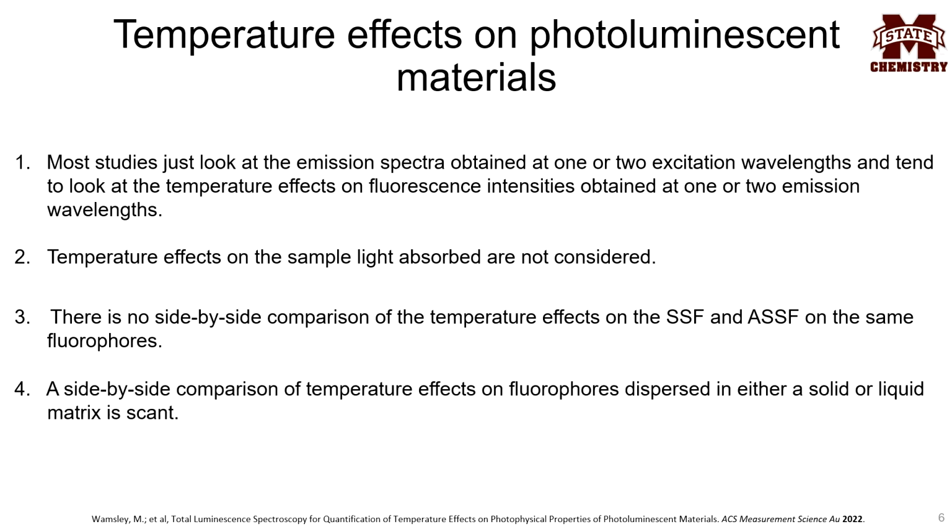Next, studies have only looked at fluorophores in either a solid or liquid matrix. Once again, a side-by-side comparison of temperature effects on fluorophores dispersed in either a solid or liquid matrix is minimal. Such a study would give an insight on the influence of the sample matrix on temperature effects.